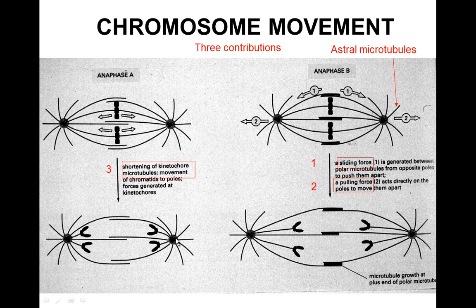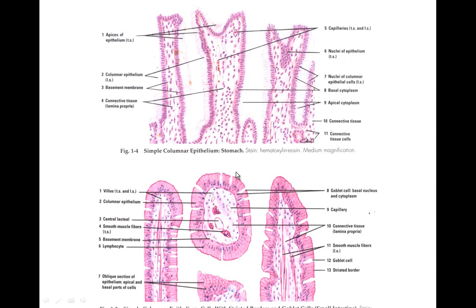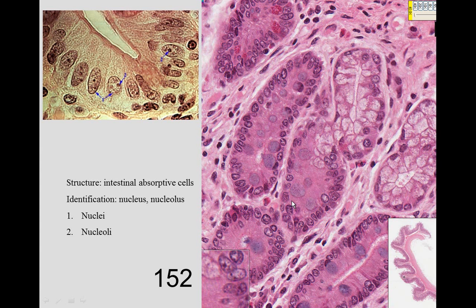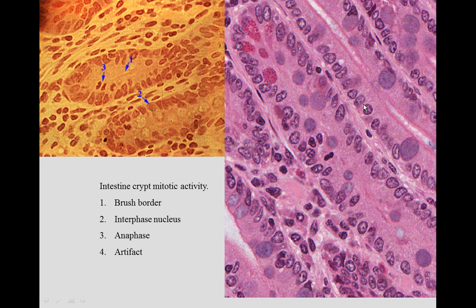Whenever the kinetochore microtubules shorten they pull the chromosomes to the side. Here we see the atlas view of intestinal absorptive cells - simple columnar epithelial cells with brush borders. Today we are going to look at the nucleus inside. In slide 152 we see the nuclei of these different cells, and sometimes you can see the nucleoli as well. We see intestinal absorptive cells, goblet cells, and Paneth cells at the very bottom. We can see interphase nuclei but also metaphase plates, which is an indication of cell division occurring.